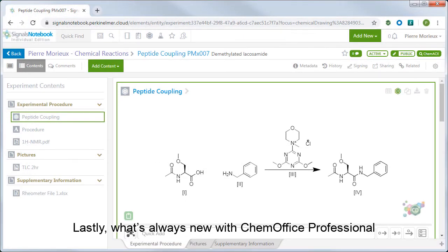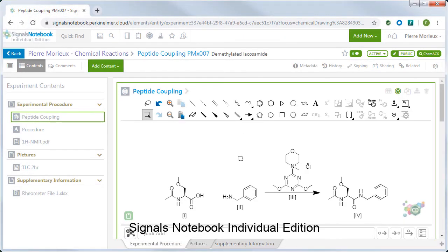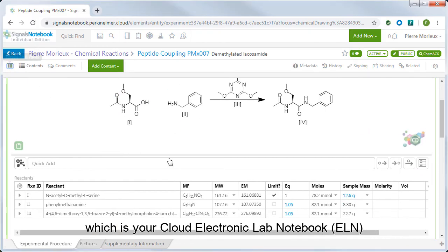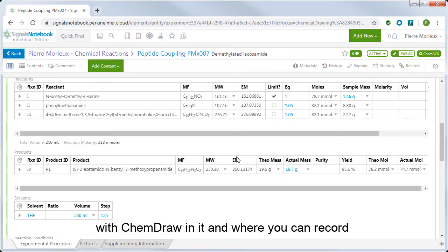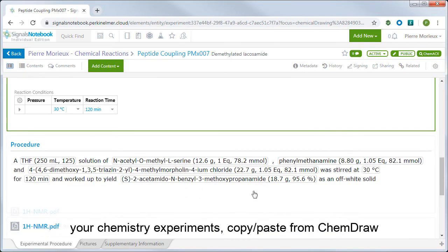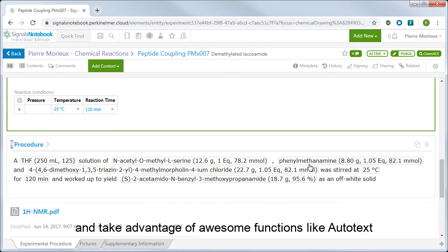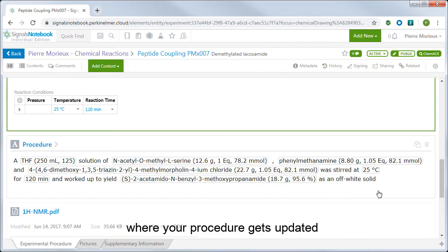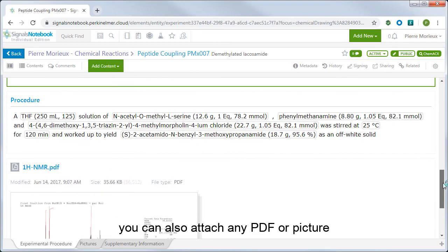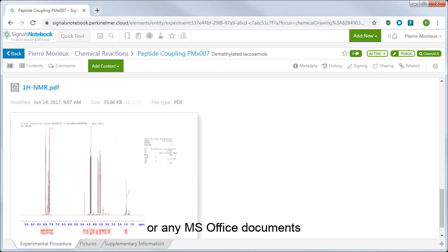Lastly, what's always new with ChemOffice Professional is Signal's Notebook Individual Edition, which is your cloud electronic lab notebook with ChemDraw in it, and where you can record your chemistry experiments, copy-paste from ChemDraw, calculate stoichiometry and yields, do structure searching, share experiments, and take advantage of awesome functions like auto-text, where your procedure gets updated when you modify another field in your experiment. You can also attach any PDF and annotate pictures or any Microsoft Office documents, so be sure to check it out as well.